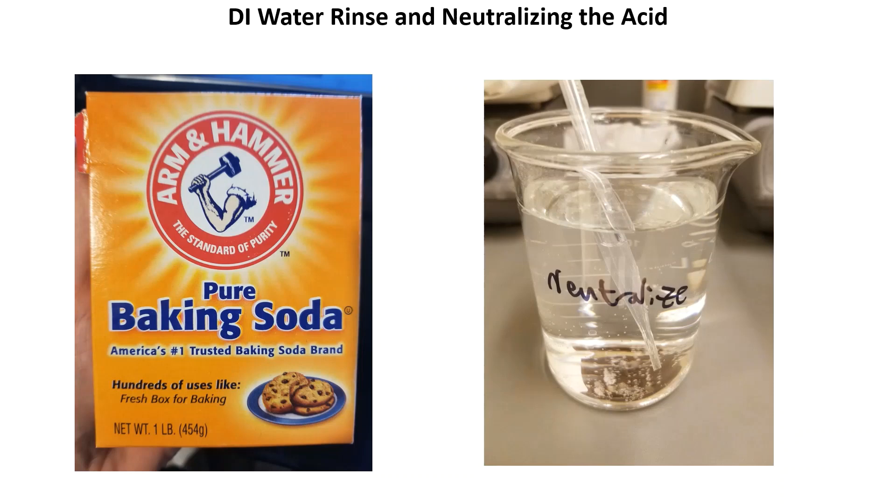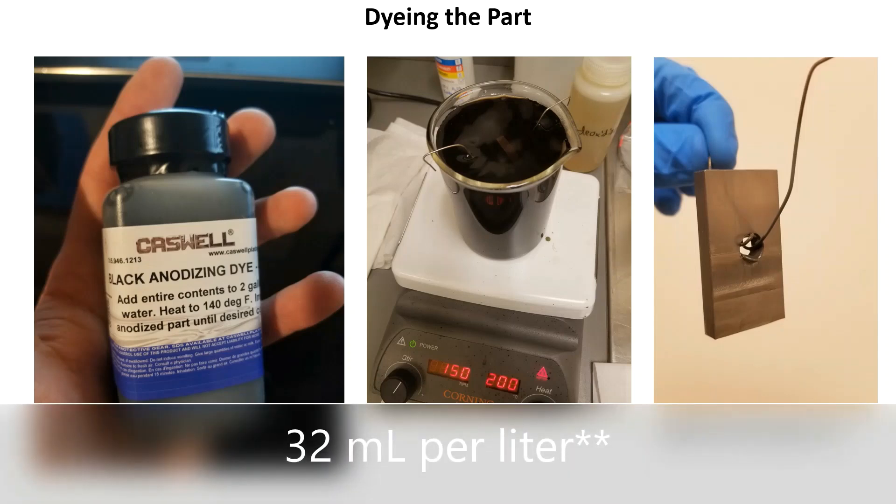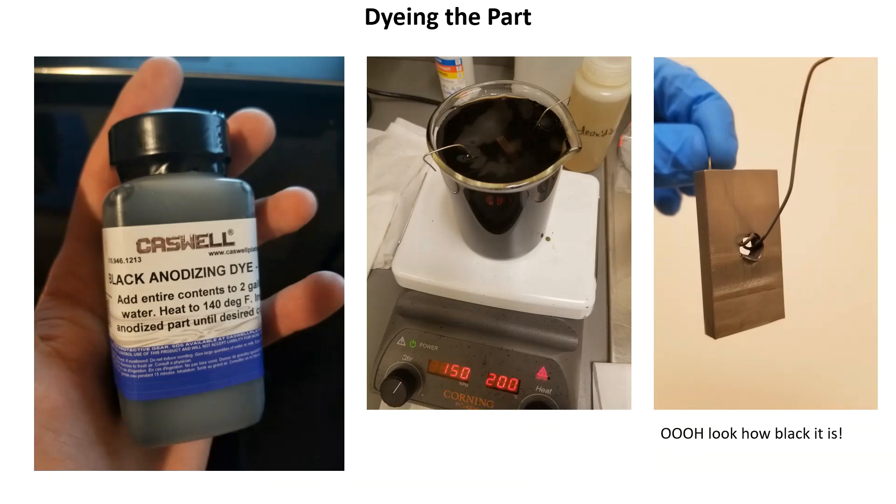I bought black anodizing dye from Caswell. Per the instructions of the chemical I mixed 16 grams per liter of dye in DI water and heated it to 60°C. I let the part soak in it for 15 minutes with a magnetic stir bar going. I pulled the part out and rinsed it with DI water. Obviously the part did not turn out very dark at all and I will go into detail as to why I believe this happened a little later.